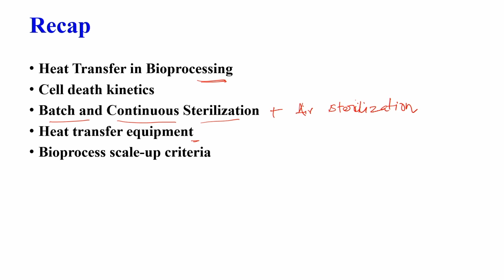exchangers. What is important for having good heat transfer equipment is to increase the heat transfer rate.